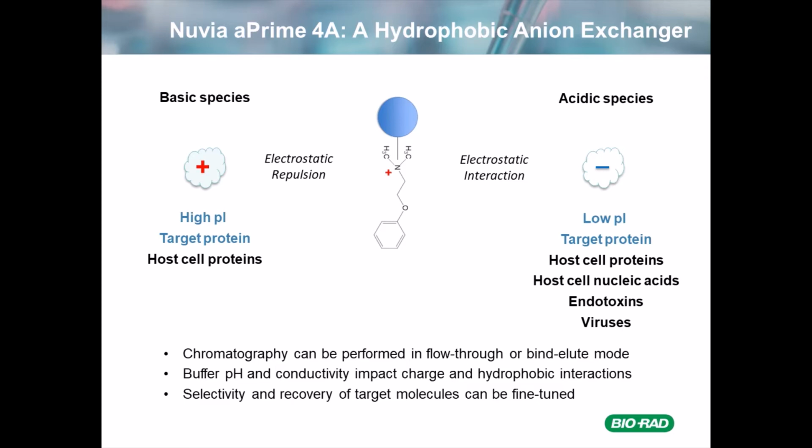A purification of the target protein can be performed in either the flow-through mode or bind and elute mode. We can manipulate a buffer's pH and conductivity to achieve our desired selectivity and recovery of the target protein molecules.